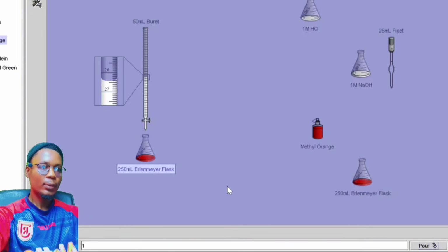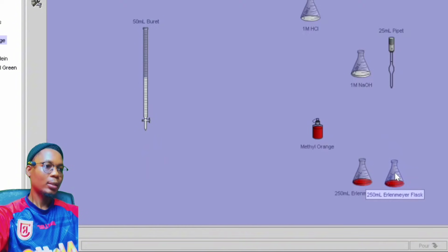Okay, so in this case I have 26.50. Okay, so remember the first time I had 27.10, so this time around I have 26.50.